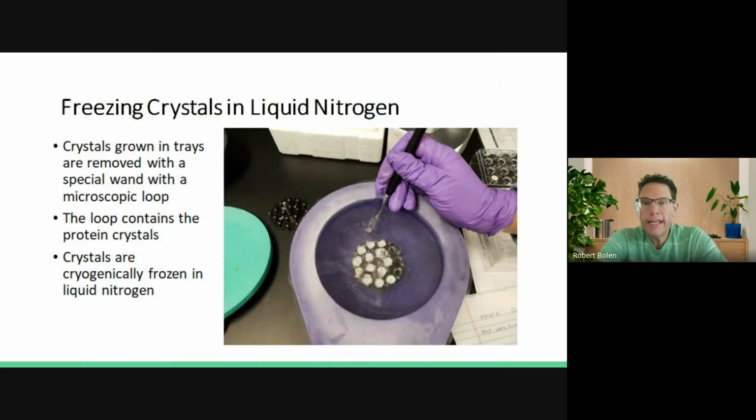And again, just to recap what Mr. Pinto talked about yesterday, we freeze the crystals in liquid nitrogen, right? And those crystals are then placed inside of the puck. So that's an actual puck that one of our students is working on. And those white little dots indicate the small little pins that contain the cryo loop that has the protein in it. And by putting it in the liquid nitrogen, it preserves the protein and it maintains its stability.